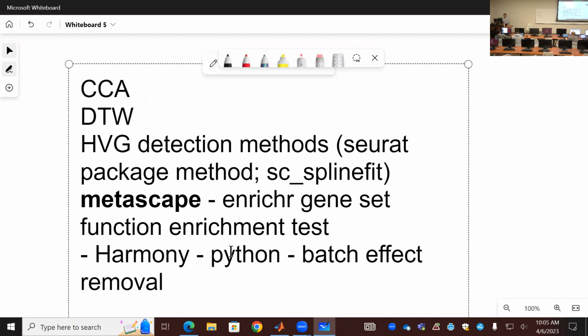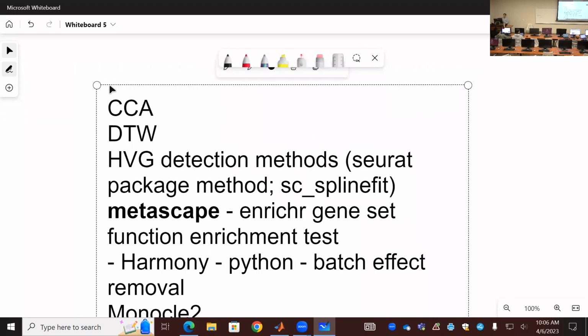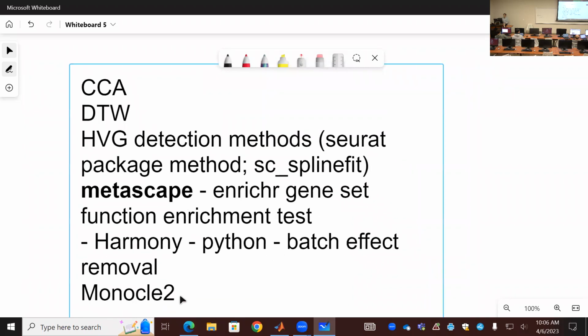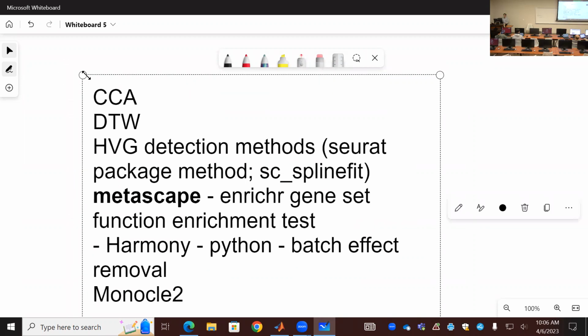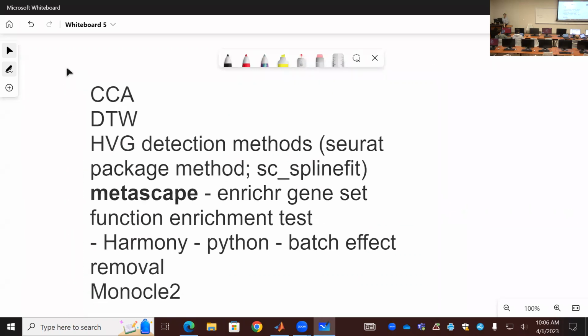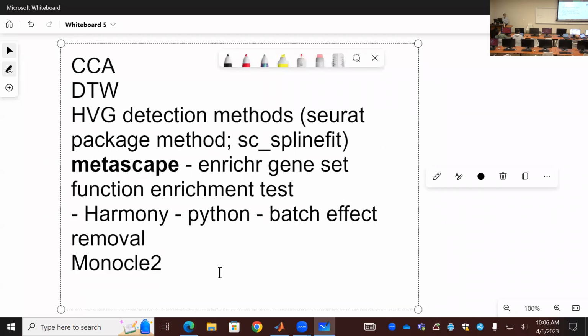At the end, we will look at Monocle. We are talking about Monocle 2. Recently, there is a bug, and a lot of people just cannot run it; people online talk about this bug. But let's see if we can successfully infer some trajectory. My guess is we don't have such luck, and we may not be able to run it.